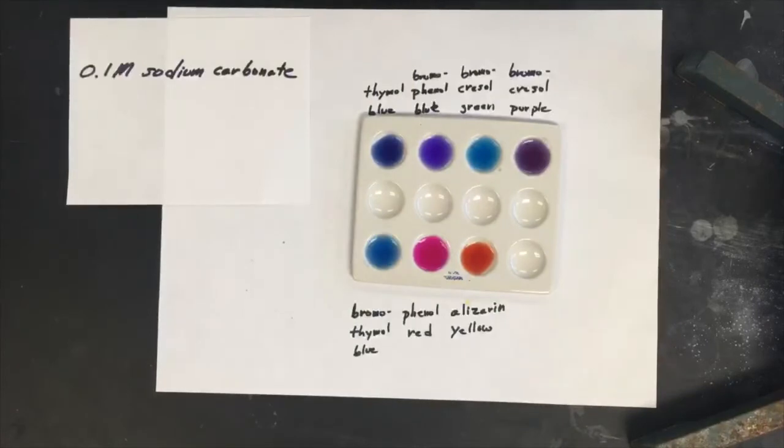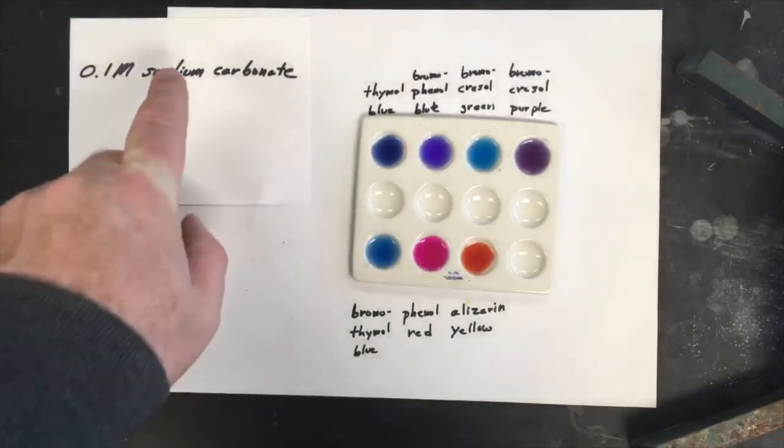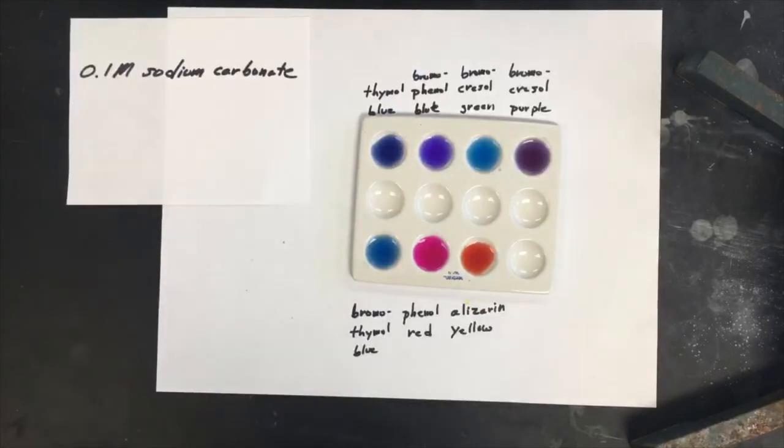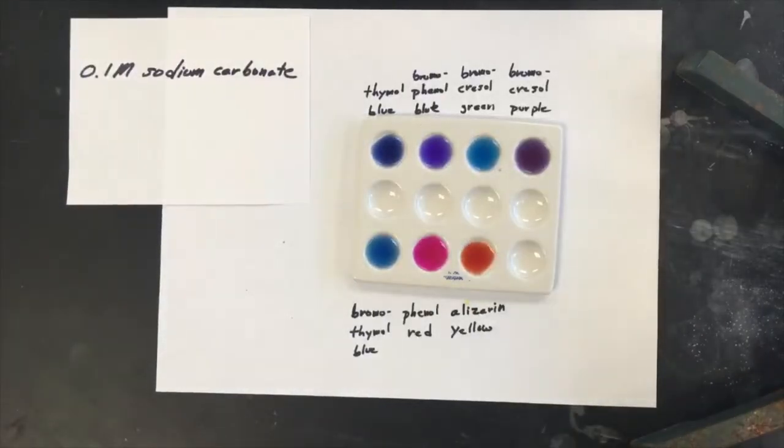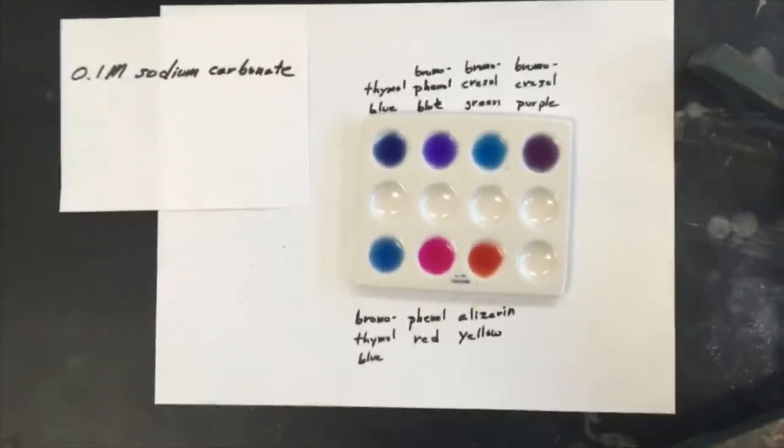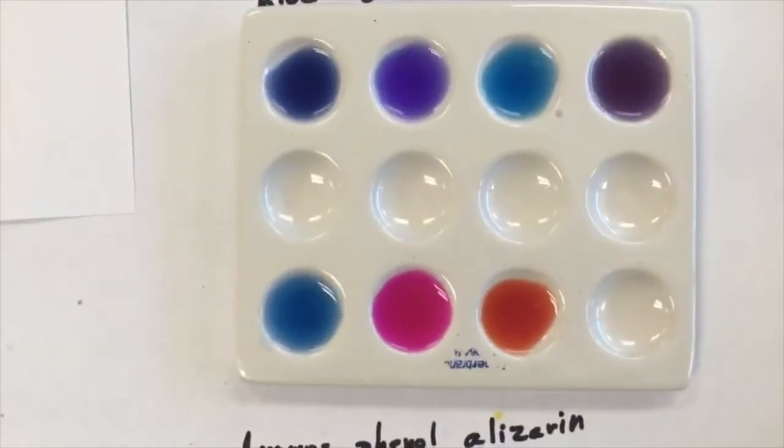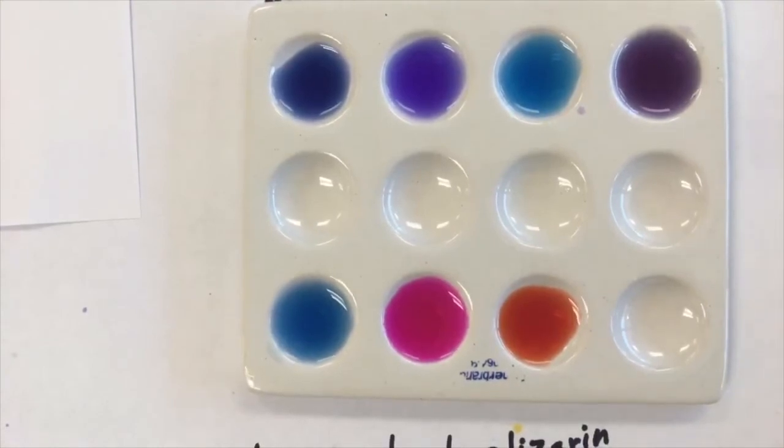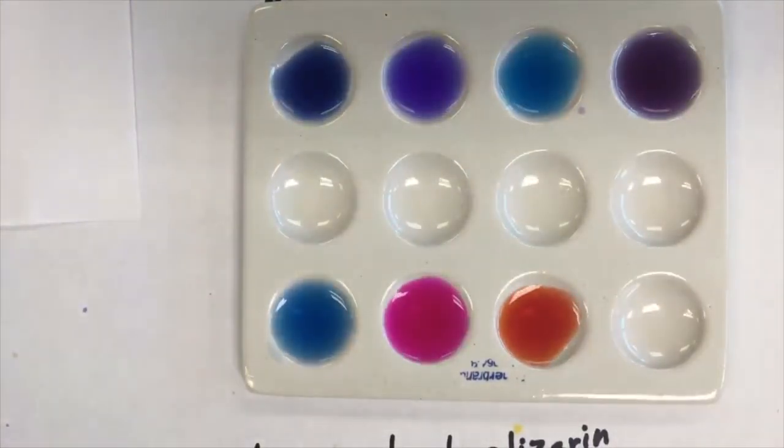So here we have the next sample. It's 0.1 molar sodium carbonate. Yeah, we definitely got some different colors now compared to earlier ones. Let me again zoom in so you can get a better picture or better idea. Try to be descriptive. You know, we got blues and purples here and try to describe them as detailed as possible. It's good to make detailed observations of your experiments.